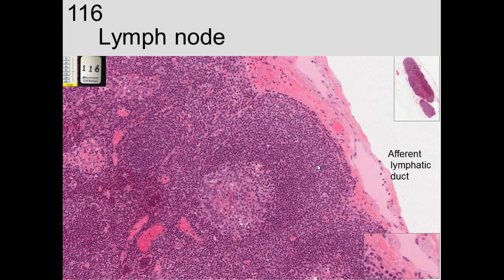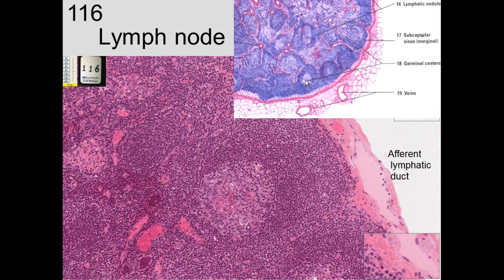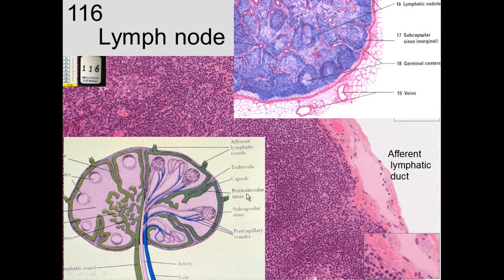On the outside, afferent lymphatic ducts bring lymph into the lymph node from all different locations around it. You can see a valve in these ducts and follicles with germinal centers — the light areas within the follicle. The afferent lymphatics drain fluid from various tissues; it flows down through the subcapsular sinus and then exits through the hilus region.